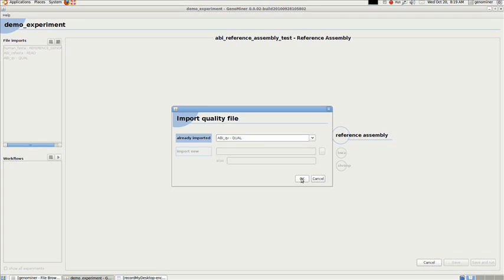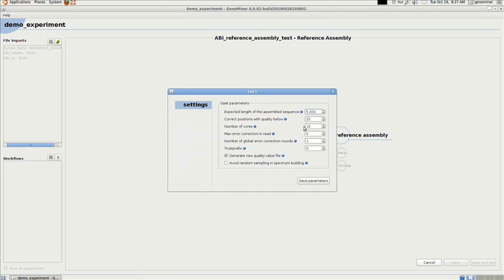As a first step, a spectrum of all k-mers is constructed from the set of all reads, and then each read is corrected one by one if necessary. SAET transforms corrected reads and quality values into new CS/FASTA and qual files respectively. Behind the question marks, you will find some help about setting parameters of modules. The information provided here can navigate you through the parameters to give the right setting for your particular analysis. All parameters have a default value, but they can be adjusted according to the aim of the experiment.